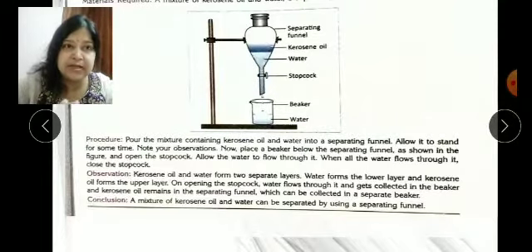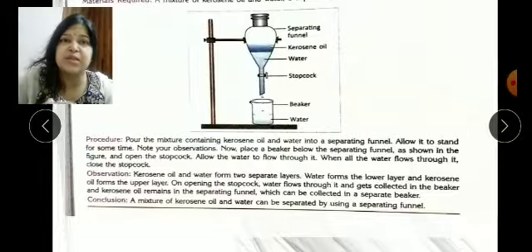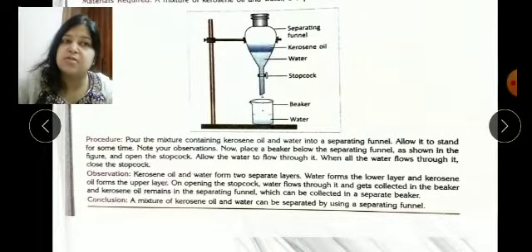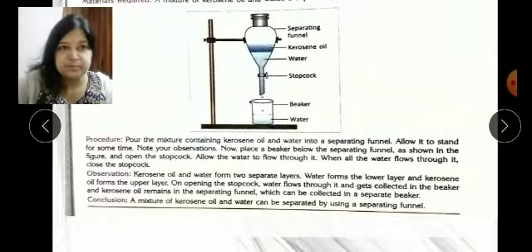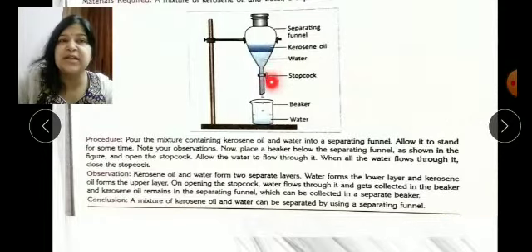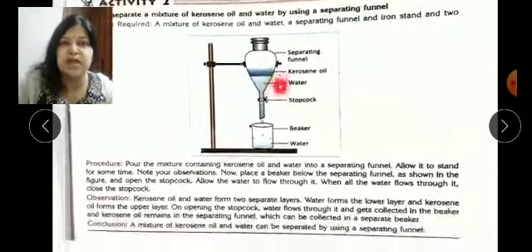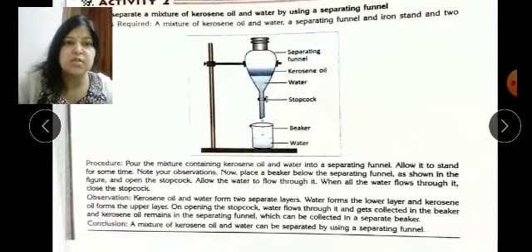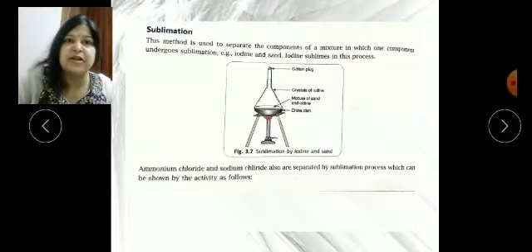First, we will collect the water slowly. When it reaches this level, immediately close the stopcock, remove this beaker, and put an empty beaker so we can collect the kerosene oil through this method. Remember, through this method we can easily collect water and oil separately.